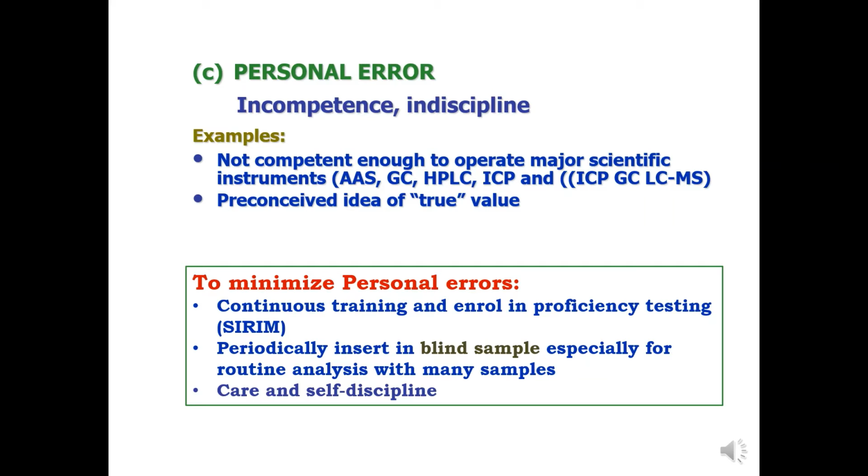To minimize personal error, we must enhance competency, so that staff have a good understanding of the theory and the practical running of the instrument, in terms of sample preparation, calibration, analysis, and all steps, including some simple maintenance. They should also be enrolled in proficiency testing and be confirmed as having passed it.